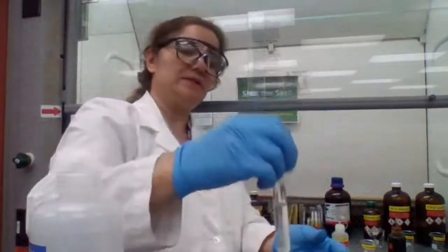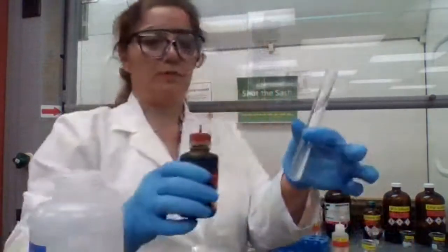Okay, it completely dissolved. I can add the iodine solution.